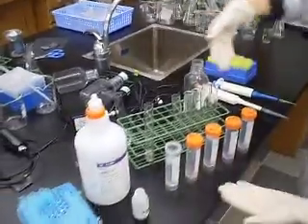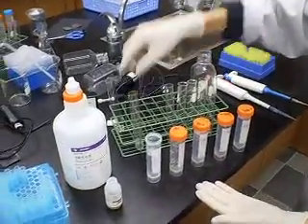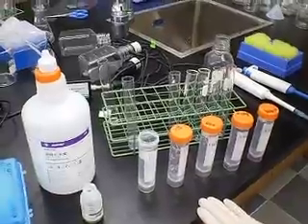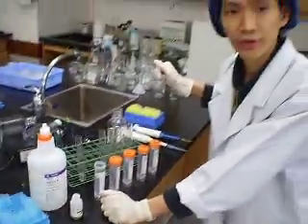So next part of my video tutorial, I'm going to show you how you're going to measure the pressure build up using Vernier Logger Pro. And this is the end of the first part of my video tutorial. Thank you.